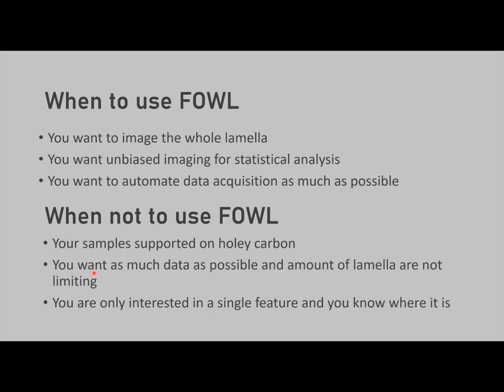And I think you can image lamella faster than you can make them, so that might not be the case. And of course, you don't want to do that if you're interested in a very specific feature of a cell, in which case you don't want to image everything else. But that also is the case if you really know where it is in the lamella, right? So if you have very good CLEM, for example. But if you don't, it might still be very useful to, in the beginning, image the whole lamella and then later figure out where it is.